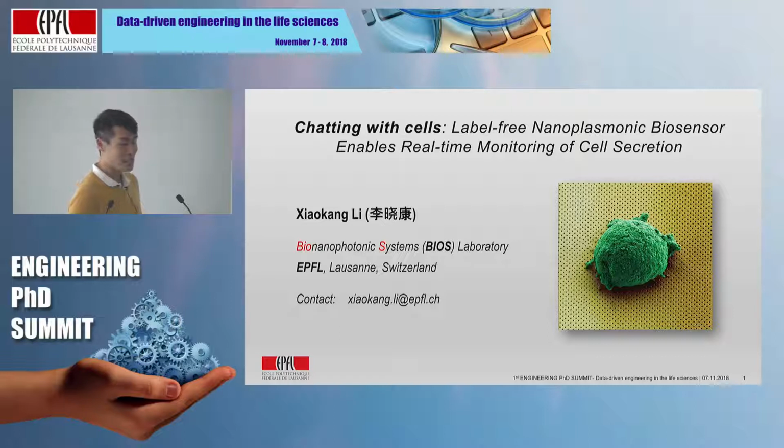So I'm Xiaokang Li. I'm working as a PhD student in BIOS Lab at EPFL. Today, I'd like to share my history of chatting with the cells by using a label-free nanoplasmonic biosensor, which can enable real-time monitoring of cell secretion.